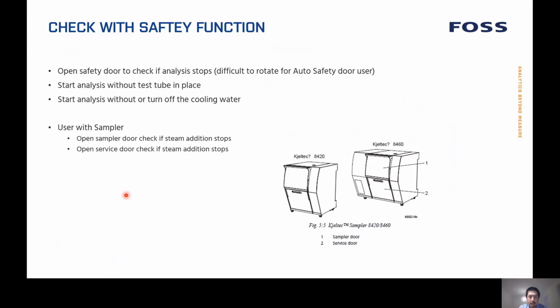When the cooling water is not on, you will get inaccurate results because the distillate temperature is too high, which can cause ammonia loss in the procedure.